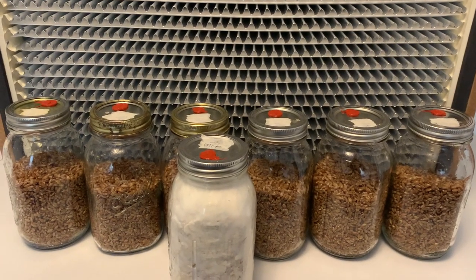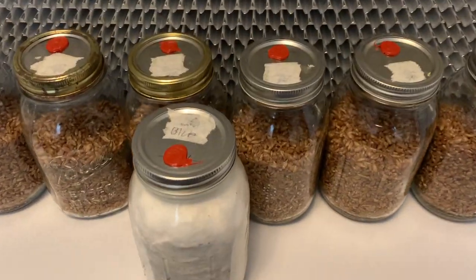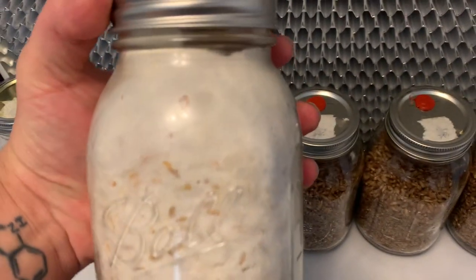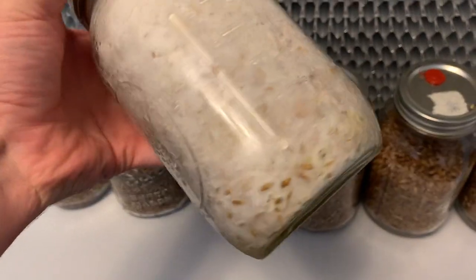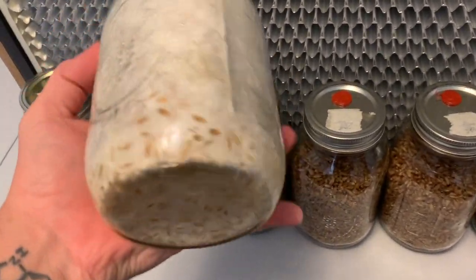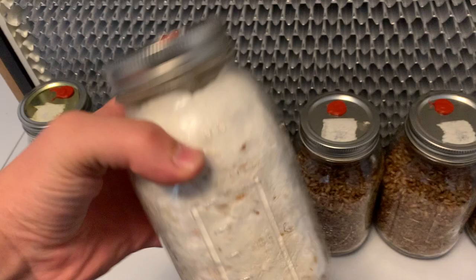Welcome back to Spawn Sprout. In this video I'm going to show you how to do a grain to grain transfer. This method is perfect for increasing the amount of mushrooms that you're able to produce. In this example I will be turning one quart jar of spawn into six quart jars of spawn.